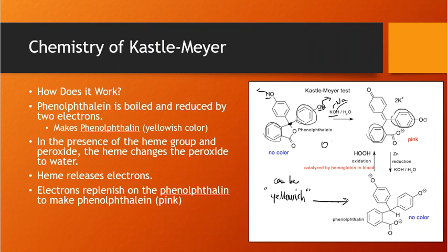Those electrons between the O and the H bond, once the H gets ripped off, those electrons move inward to those oxygens, and then if they can, they will share throughout the molecule. And we call that delocalization. If you've not learned about that in organic yet, you will shortly. So this is what gives this thing a pink color.